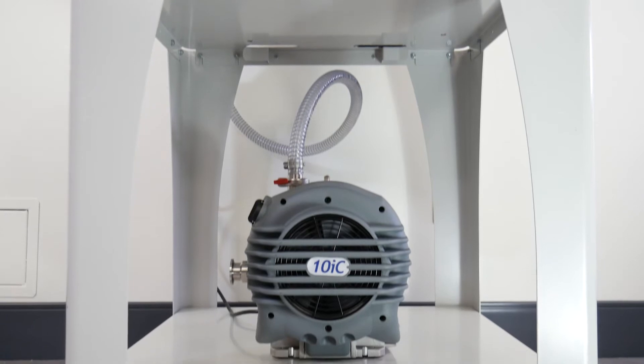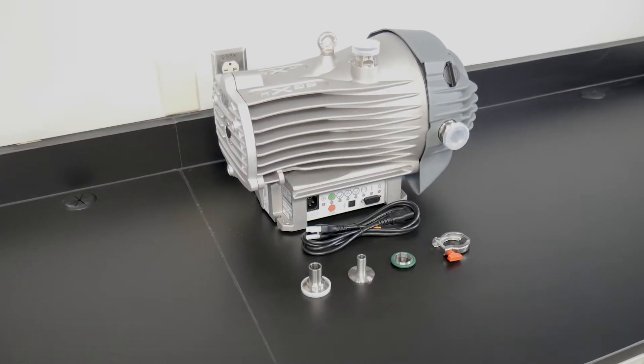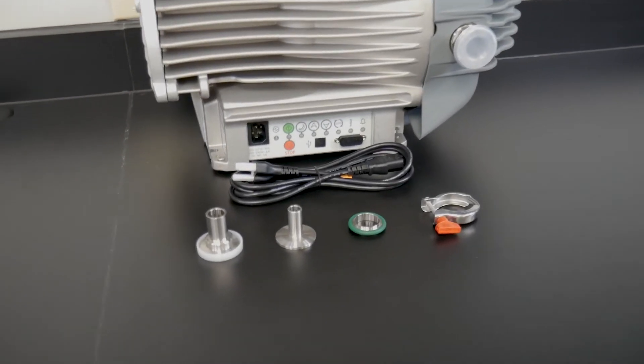LabConco's dry scroll pumps can be used across various pieces of equipment and applications. This video will walk you through the proper installation and operation of your new scroll pump.